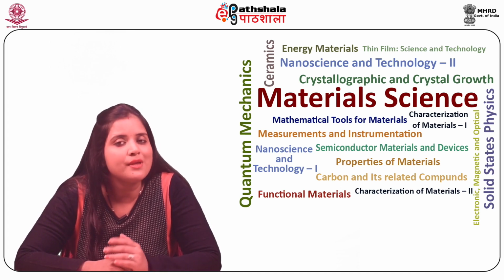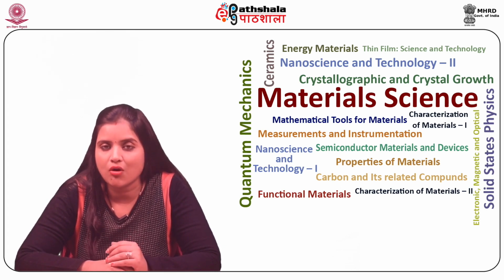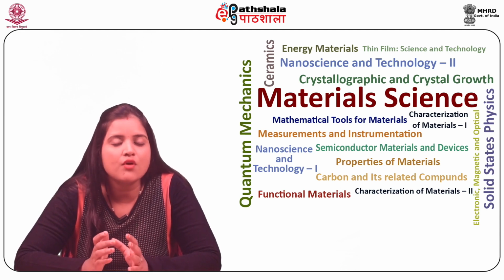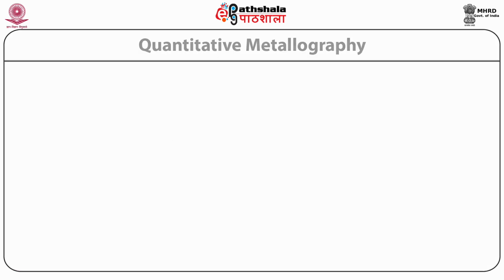Further, the samples to be investigated must not be sensitive to the oil because acidic oils may deform specimens having metallic species. Let us next study quantitative metallography.